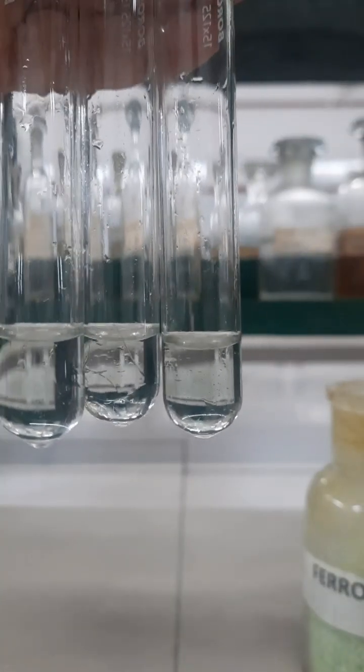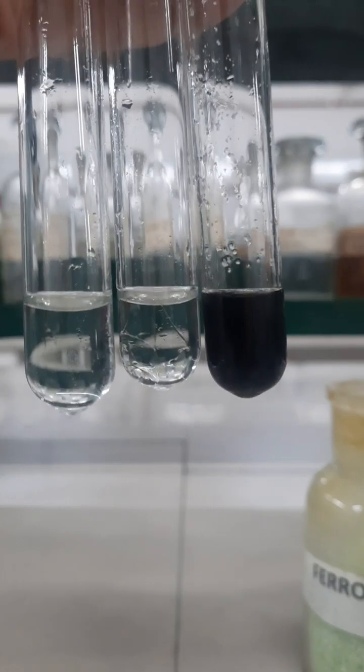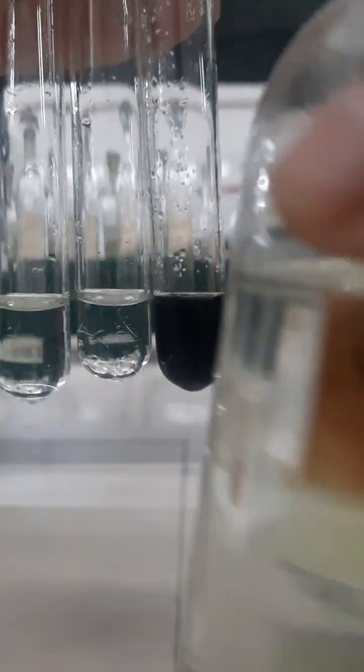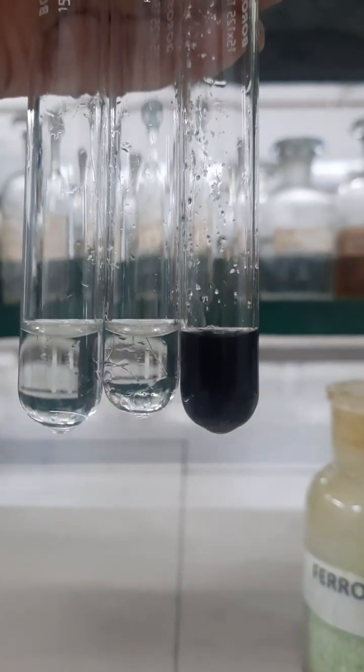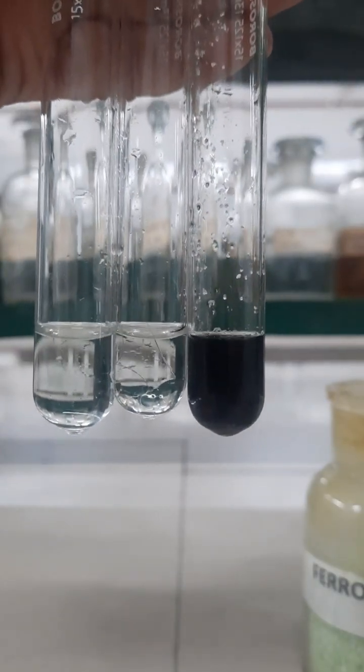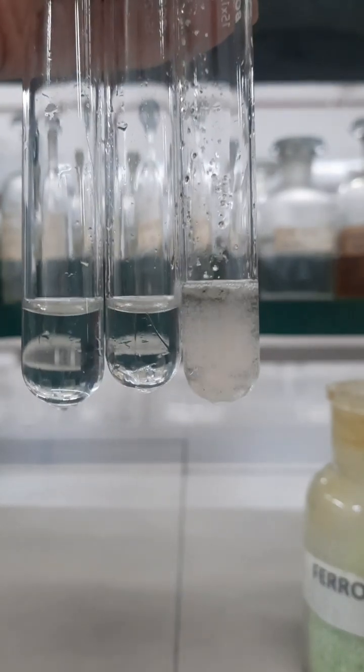In the first test tube, I am adding ferrous sulfate salts. Appearance of black color is due to the formation of ferrous sulfide. When concentrated sulfuric acid is added, the prussian blue color will not appear.